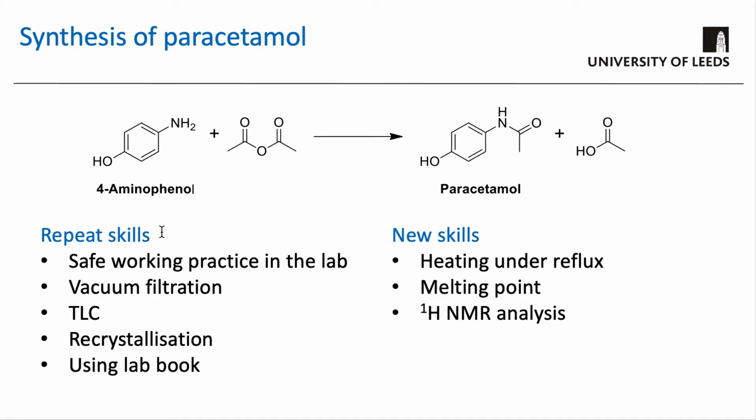And so the purpose of this experiment is to give you practice of performing synthetic chemistry and practicing these particular skills that you've performed before, but also it's going to introduce these new skills as well, which are heating under reflux, which is the main way in which organic and inorganic compounds are made when you need to heat the reactions up. And also melting point analysis, which is a way of working out if you've got the correct sample and how pure it is, and NMR analysis as well.